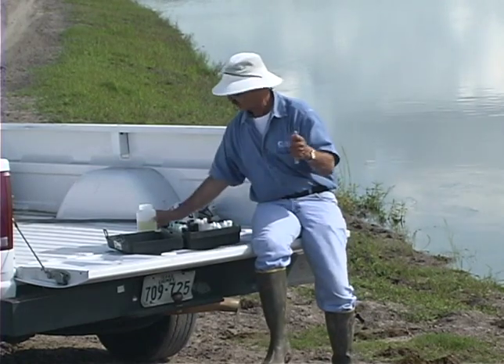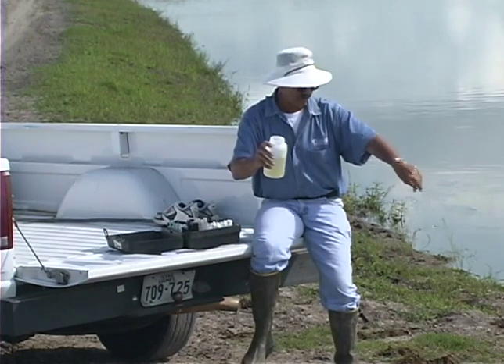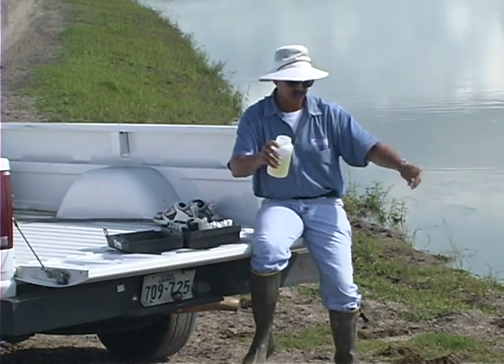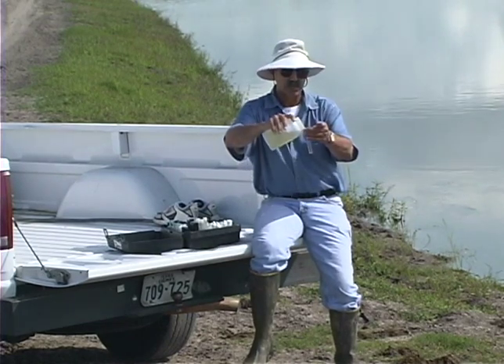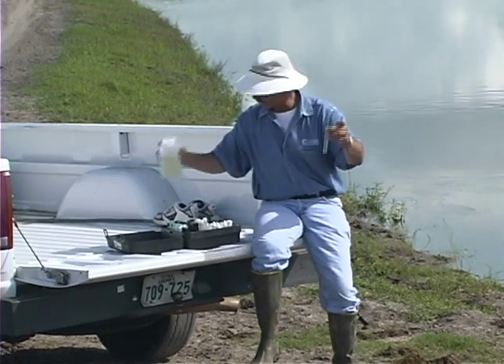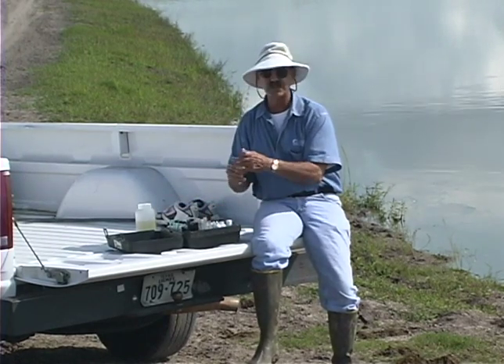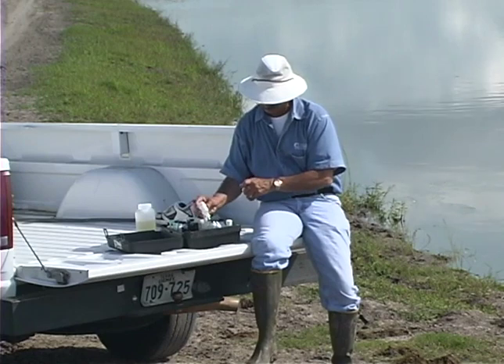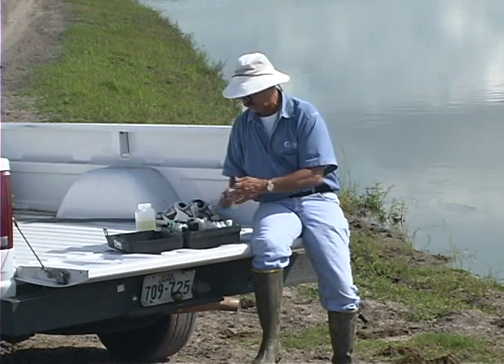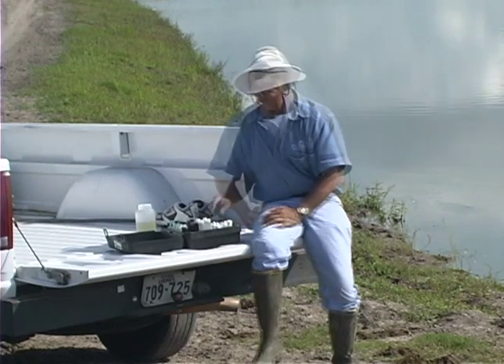We start with a completely clean test tube. We have to make sure that we don't have any other water in our test tube, no reagents from previous tests. Start with a clean sample, 5 milliliters of water. With this test, we use 2 different reagents. The first reagent is 4 drops. And now we need to wait for a minute for those reagents to work in that water sample.